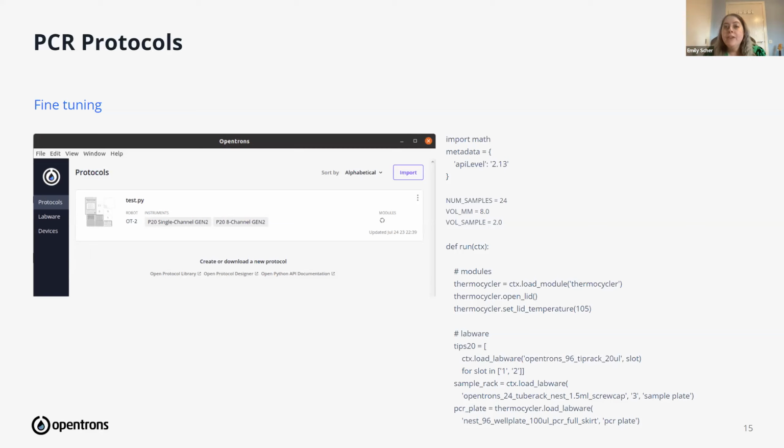But in terms of having a particular threshold that we're looking for, it's kind of an unfortunately unsatisfying answer to say that we just want it to work pretty well most of the time. So we're measuring, for example, how many errors we are getting if we put this through simulation? How many iterative rounds do we have to put it through before we can actually run it? And then we're just trying to keep track of that and make sure that we're heading in the right direction.